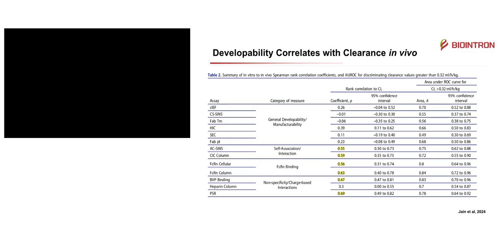That proves that this simulated in vitro assay focusing on the performance of the molecule, some physical chemical performance, and also non-specific binding performance will give you a very good guidance on how your molecule will perform in vivo or in human.